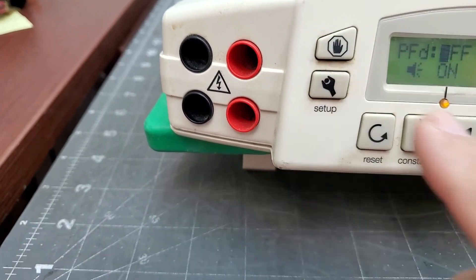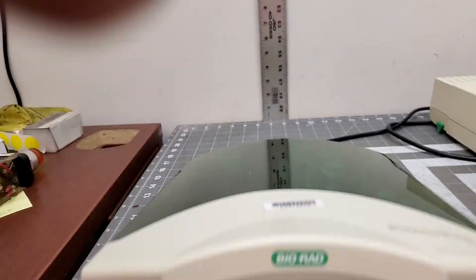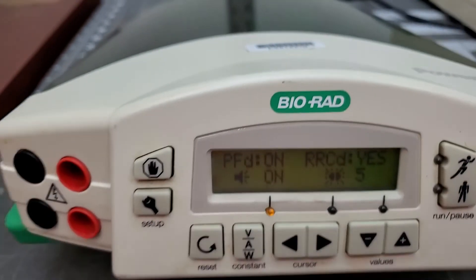110 volts, normal plug. I'll have some still shots of it also. Nice clean shape. Good luck bidding.